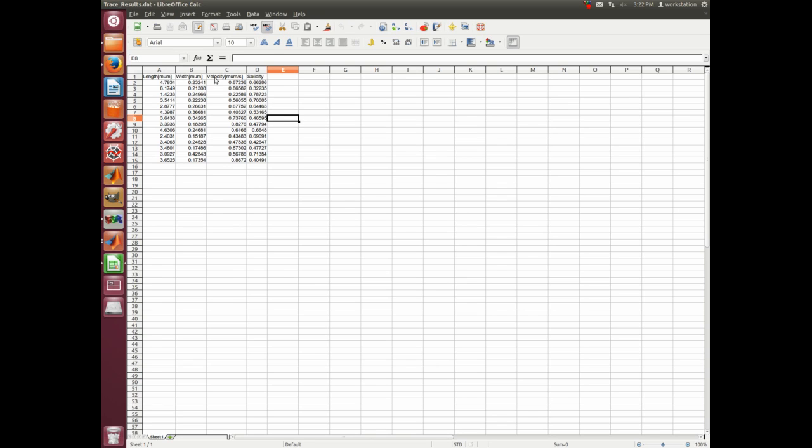So you can see here the probably most interesting column would be that one here, where you can see the velocities that were observed in the assay. So you could go here and say you want to have the average of all these velocities.